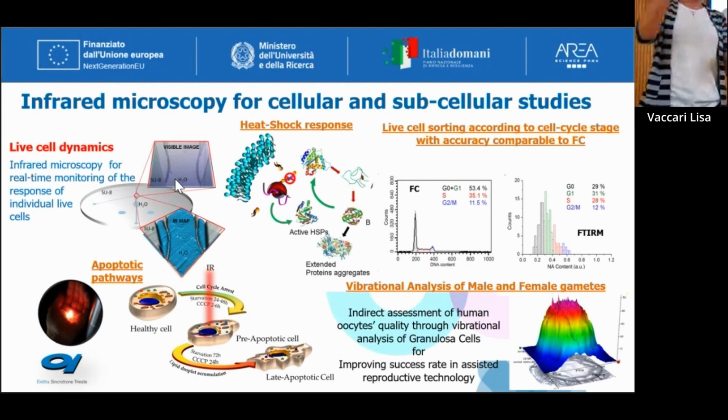And then the next step, when we could do this, is to try to test a large variety of cells treated with different viruses to try to understand which is the phenotyping, which is the profile that a cell should have once infected by a specific virus. This is a phenotyping in such a way that at a certain point, if you have a totally unknown virus that happens and there is an infection all around the world, you do some measurements and you at least can identify the major pathways that are affected by this virus. This is one idea, and you can do it obviously in combination with many other techniques. So this is the first approach.